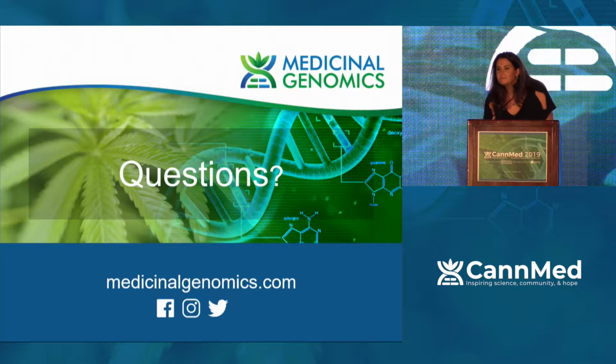Yeah, this was a really interesting talk. Not working in this field, I was a little confused at first when you described this as dead DNA. Isn't it that your test is detecting any free DNA attached to the cells? And if for some reason there was cell lysis that occurred during the preparation of the extract, would that skew your numbers?